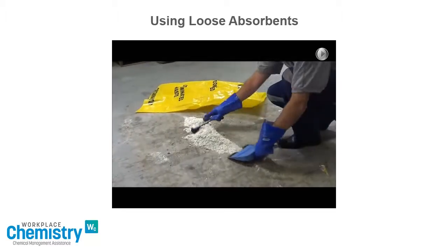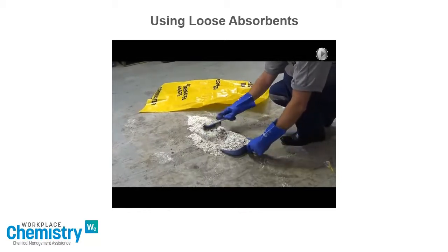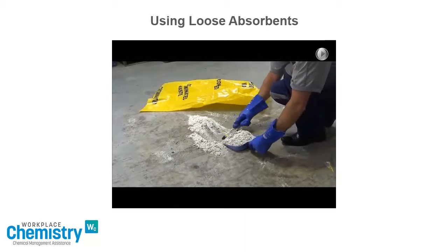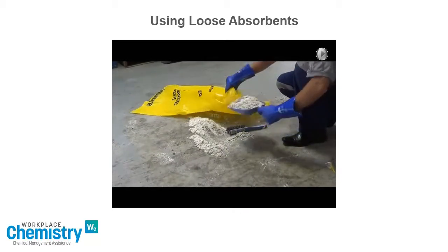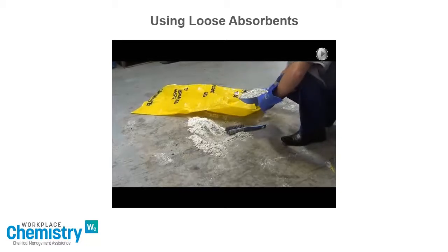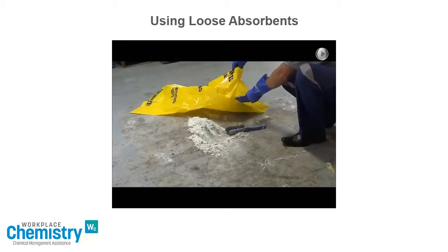Once the spill has been absorbed, we collect the used absorbent with a dustpan and brush. We dispose of the used absorbent the same way we would dispose of the spilt chemical.